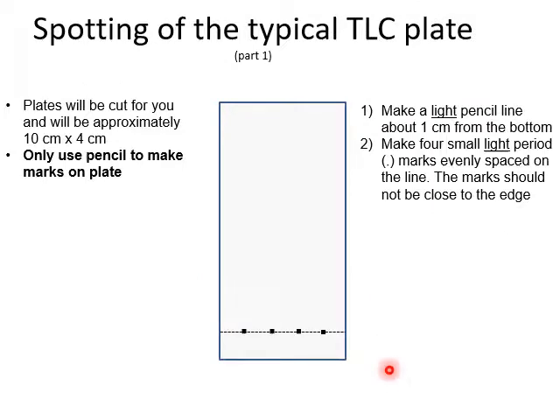Again, this is the anatomy of the TLC plate. Plates are quite small usually, and in my laboratory we can usually conserve materials by drawing a line here with pencil. You only use pencil to make marks on the plate. Inks will, of course, run with the solvent and mess up your experiment. But your pencil marks should also be very light, because if you use these, you'll very quickly notice that you can scratch the silica off very easily. And if you start making holes, it also messes up your experiment.